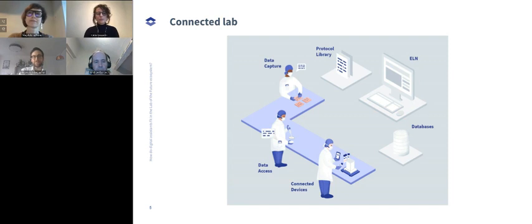Yeah, well, I guess Andrew gave the perfect explanation already. It's the most natural way of communicating, and that's why voice-powered assistants and digital lab assistants are so powerful. But to be honest, I think we have to take a bit of a broader perspective. If you look into any kind of research, hundreds of years ago, at one point we went down the route of documentation and writing. And indeed, I can only echo what Andrew said. We moved from paper-based documentation to digital documentation. That's why we have ELNs.